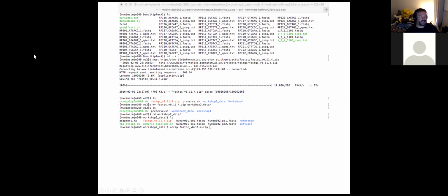All right, so once you've copied that link, you'll go into your terminal, which should be in an interactive session, and you're going to CD into your WS2 folder. So it'll be CD, and then Workshop 2, and then CD WS2, and that'll get you into this WS2 folder. Yeah, the index can take a minute or two. Although for some reason it seems like the cluster is running a little bit more slowly, because usually this goes a little bit faster.